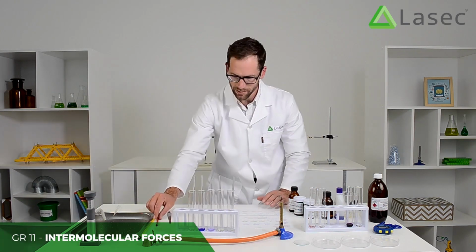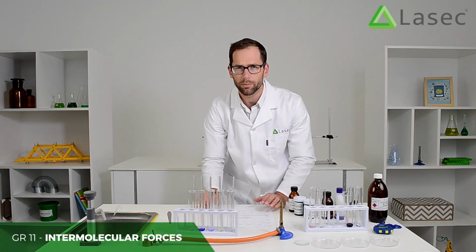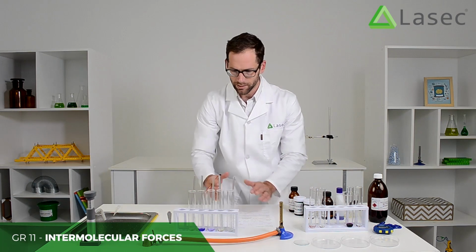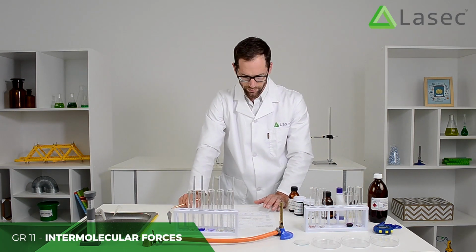Right, I can write down my observations here on the capillary action, which one's risen the most, and try to measure it off a bit. Measuring accurately will be tough, but if you bring the capillary tube to the front of the test tube, you can get an average of at least which ones have a greater capillary action than others.